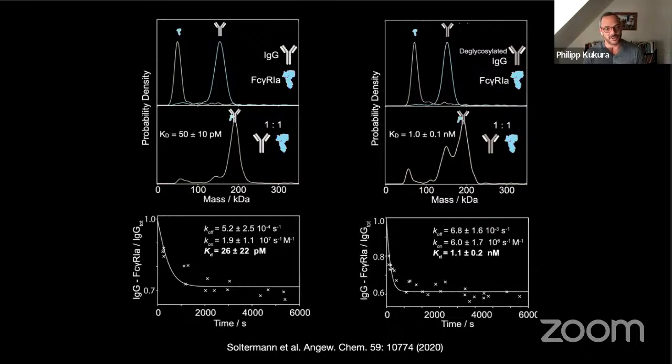We're actually at the moment working on trying to really figure out what happens when you denature a protein. It's one of these classic examples where you're in an office with a whiteboard. You're like, oh, we're just going to denature the protein and measure the contrast, and then you do the experiment. It's a nightmare, because really getting clean protein and then really knowing when it's denatured and how it's denatured, and if you use normal denaturant, stuff sticks. It's non-trivial. And then you want disordered proteins, and how disordered are they, and how does that depend on solution conditions? So you're absolutely right.